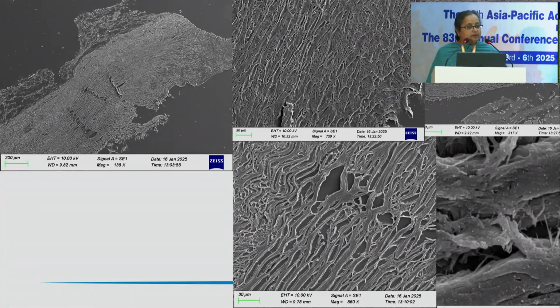Now we wanted to see whether they can be present in the scanning electron microscope images obtained from patients. Now you see a distinct distinction between the two zones here. You can see a not so clear but subtle line of demarcation between your juxtacanalicular and your corneoscleral and the other parts of the meshwork. You can see that here the meshwork is really compact, whereas here the spaces seem to be more. This is in low magnification, but just to show that the spaces are more in the corneoscleral meshwork. So we could see the demarcation, and it is highlighted here.